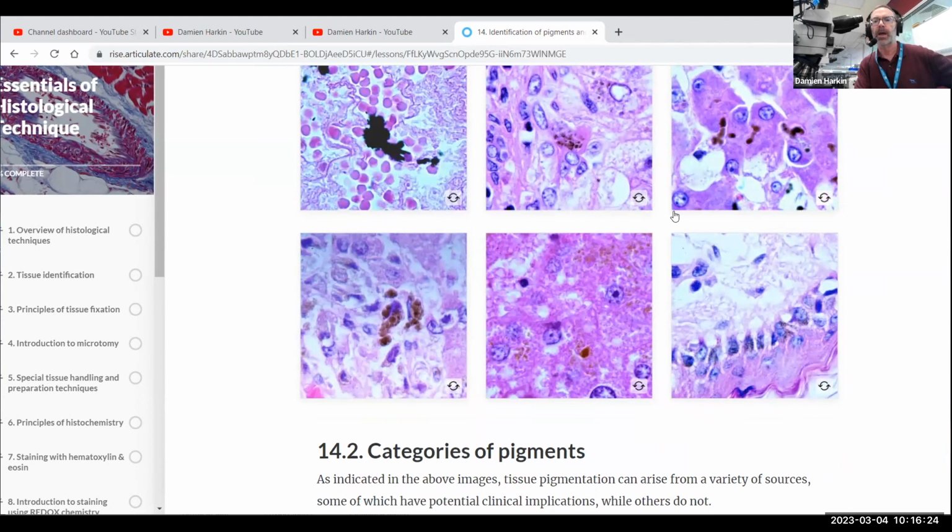posted video about some staining techniques or reactions that can be used in order to help you distinguish between these various pigments. But today, to complete this video, what we'll discuss is some very simple, straightforward procedures that can be employed that will be equally of value to helping to identify or maybe to improve the quality of a section, as in the case of the formalin pigment. So is there a way that we can remove that?